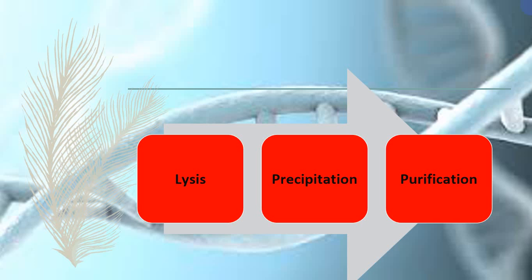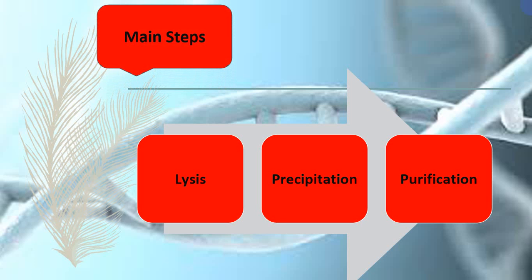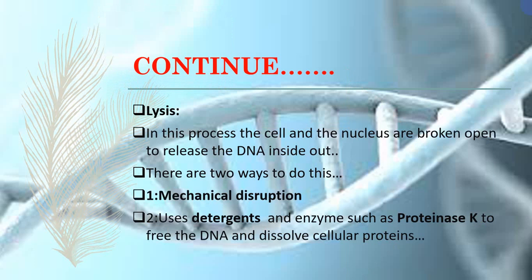from each other. In the third and last step, we purify the DNA, because the DNA is in soluble form, and the DNA is easily soluble in water solution or saline solution. So then we purify that solution with the help of alcohol. These are the main steps of the DNA extraction.